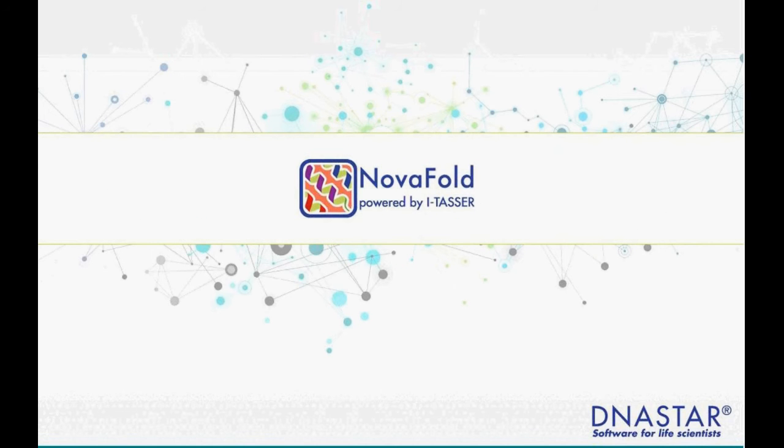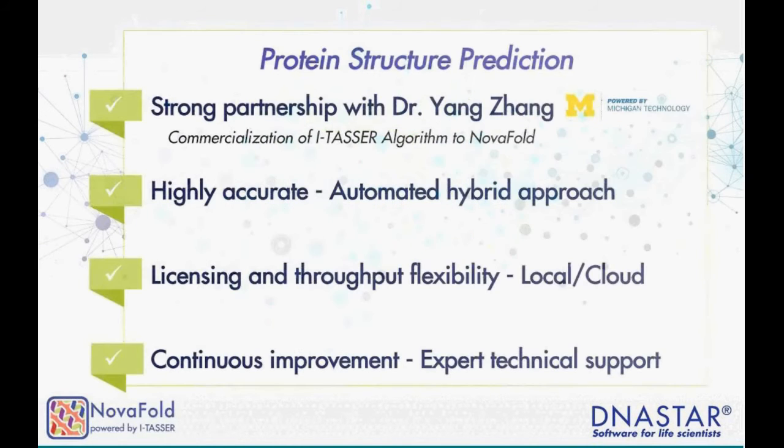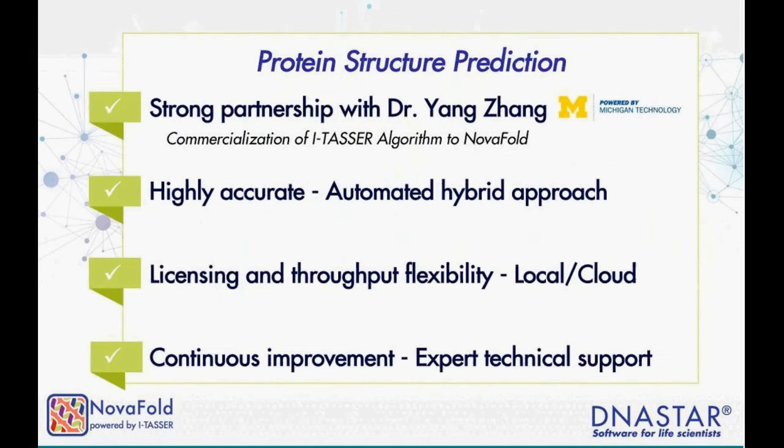So now let's get started on our introduction to NovaFold. The purpose for developing this program here at DNASTAR, and our work with the University of Michigan to commercialize it, is the I-TASSER algorithm, which was developed at the University of Michigan in the Zhang lab.